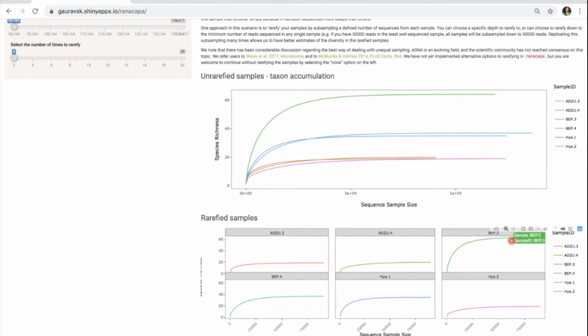And so these are for your reports. When you put this data into your reports, these are the kinds of observations that you want to be talking about in your reports. Which samples had low expected richness, which samples had high expected richness.